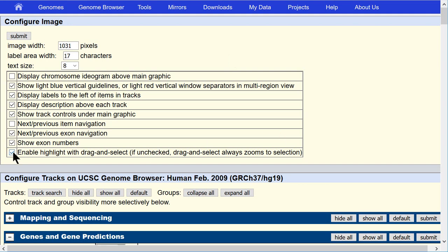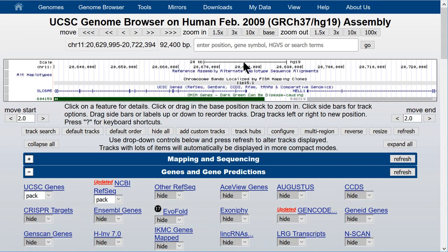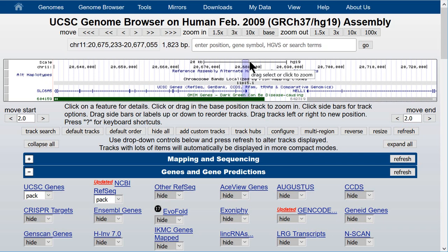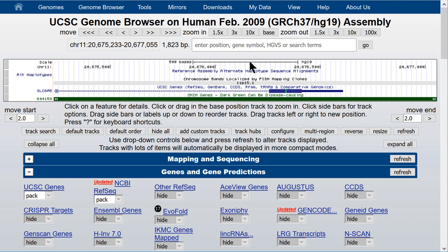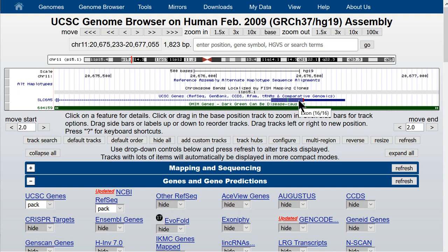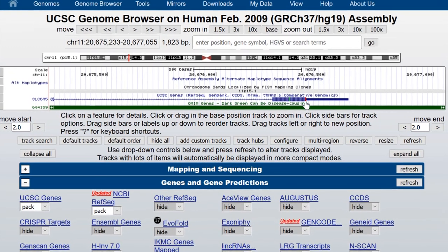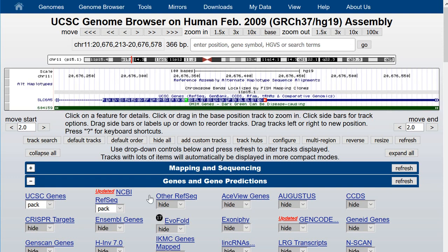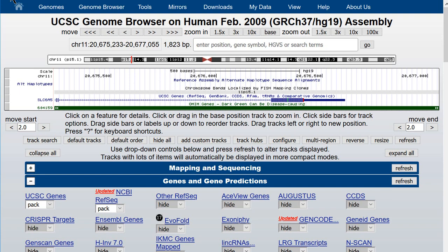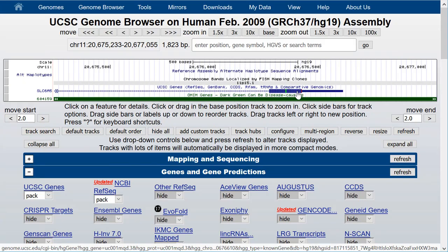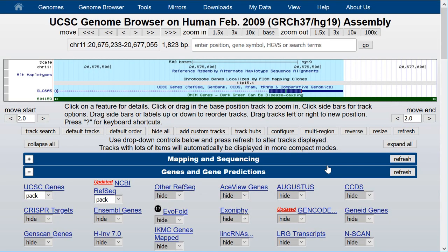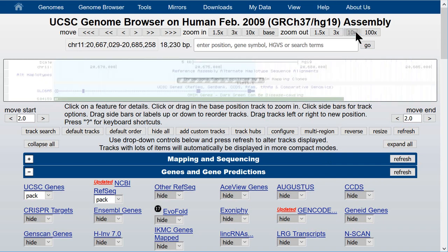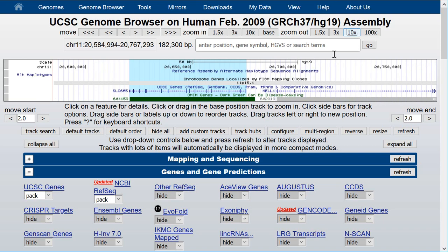With the highlight drag-and-select unchecked, putting the mouse on either side of the 3' end exon at the end of the SLC6A5 gene automatically zooms directly to that location, and we no longer have the option to add a highlight. Here you can see how untranslated regions (UTRs) at the ends of genes are represented as half-height boxes, and the stop or start codon is colored green or red — here the stop is colored red. You can still add a highlight to a whole gene using the right mouse button on the gene annotation itself, then zoom out to confirm the gene is fully highlighted. To highlight any other randomly selected region, however, you must go back to the configuration menu and check the box.